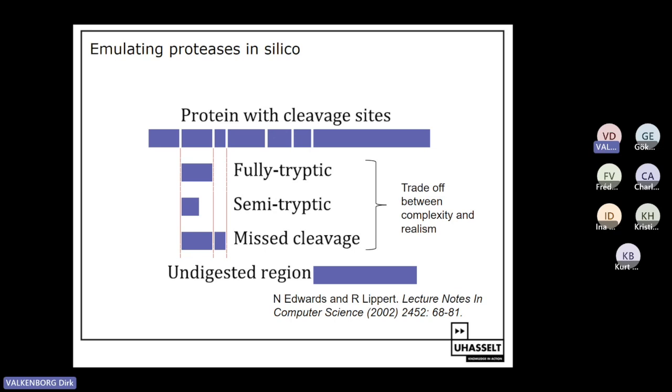Good. So what can happen in real life is that our peptide or protein has been processed already in our body, or maybe has degraded a little bit after we extracted the protein. So it's possible that we have semi-tryptic fragments.